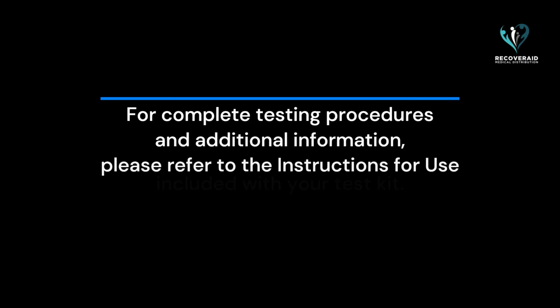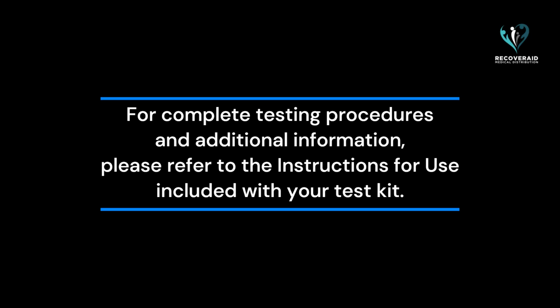For complete testing procedures and additional information, please refer to the instructions for use included with your test kit.